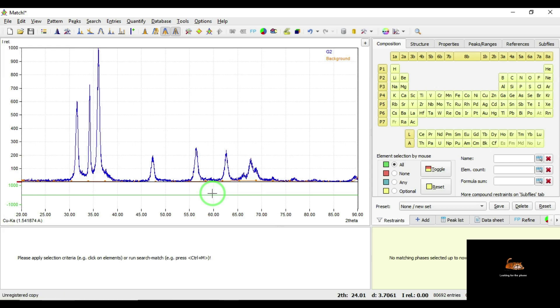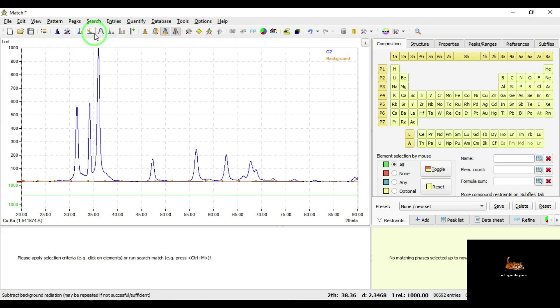Before moving further, through this program we have to do some settings. The first initial setting: click this button and the program will improve the signal-to-noise ratio. I am going to click this one. The second step is to remove the background — the intensity carried by the amorphous nature of the material will be removed if you click this knob. I am going to click this knob.